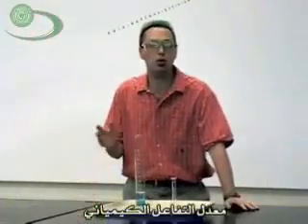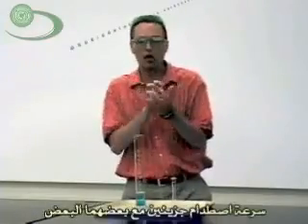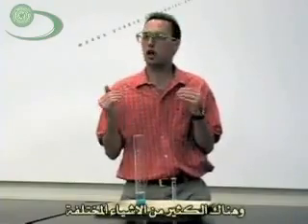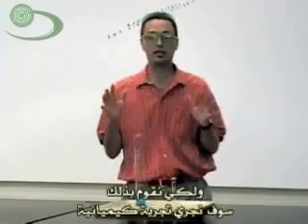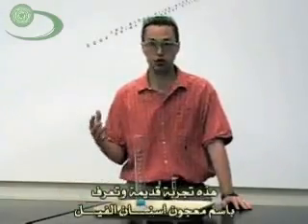Today we're going to talk about chemical reaction rates, which is how fast chemistry happens, how fast two molecules might bump into each other and become a new kind of molecule. And there's a lot of different things that can affect how fast chemistry happens. Today we're just going to focus on concentration. And to do that, we're going to use an old standby chemical demonstration called elephant toothpaste.